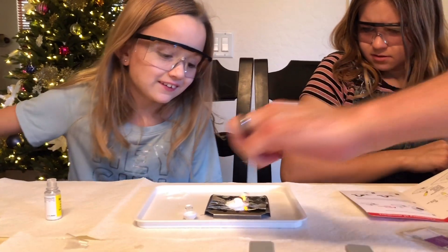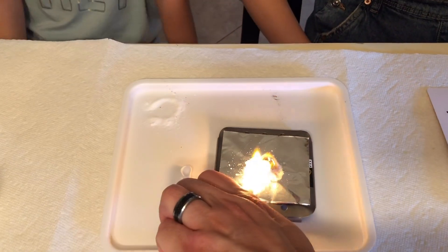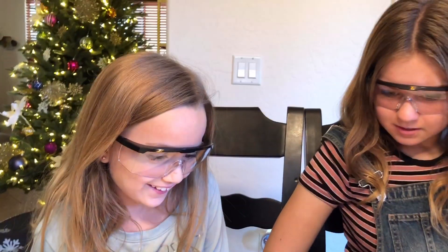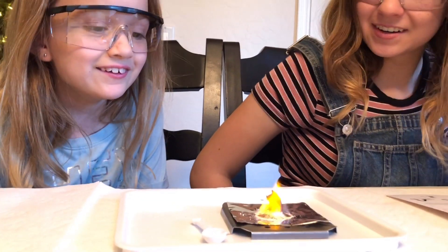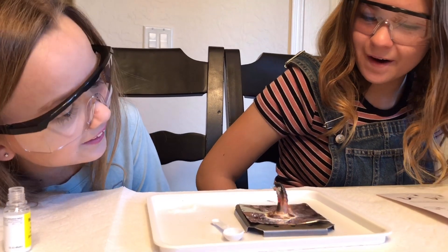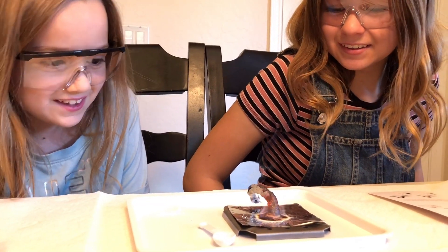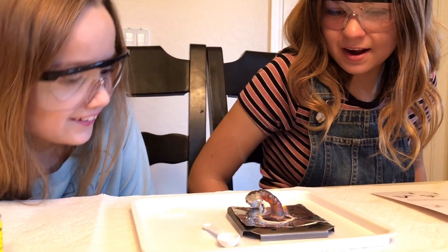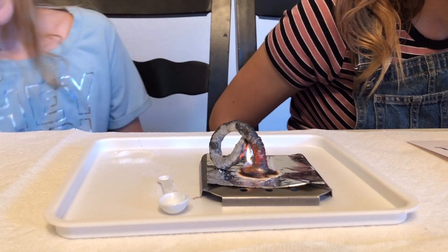There it goes - it's lighting on fire! What's happening to it? There's like... now it looks like a little - now it's gonna become a snake! Whoa, it's alive! It looks like it's growing. It's growing! What shall we name him? Bob. Great name - Bob, our carbon snake. He's kinda scary but Bob is really cool. How long is Bob gonna be? Let's find out the science behind this. His name is Billy Bob Joe now - the mystery of science.